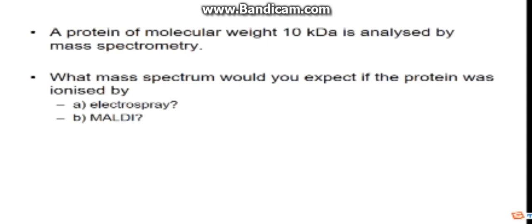Why is it not just 10 plus? Why are we doing the 12 plus and 11 plus? Why do you get the distribution? Is that what you're asking? Sorry, it's 10 plus, it's with the 10 kilodalton, isn't it? You would not expect to just have multiple 10 plus peaks. Is that not what the distribution is? No, the distribution is.